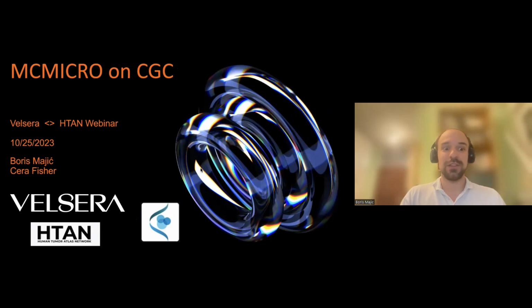So what we actually did here is we translated MCMICRO from Nextflow workflow language to Common Workflow Language, which is currently better supported on our platforms. But soon, and I don't know if I'm spoiling it or not, we will also have good Nextflow support on all of our platforms.